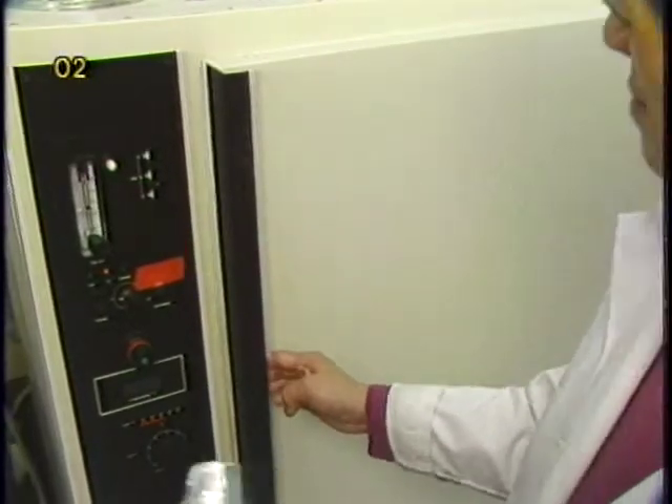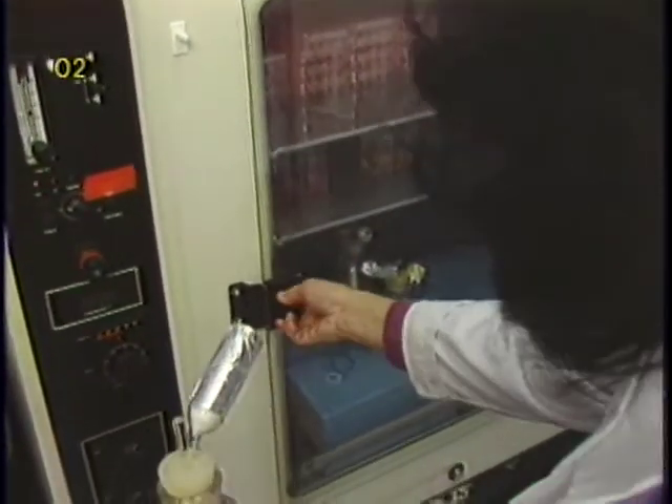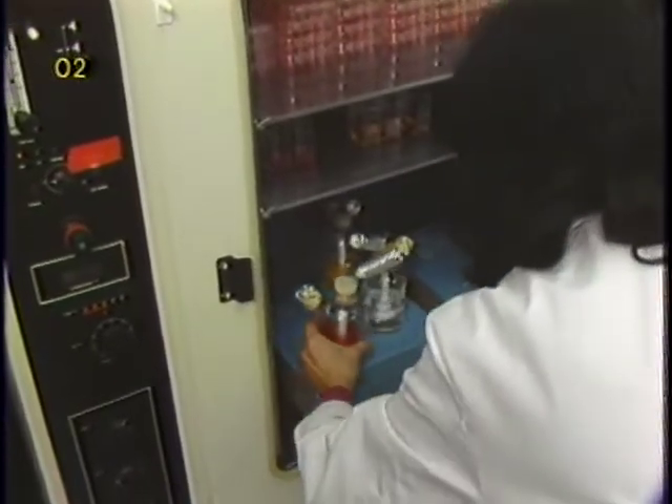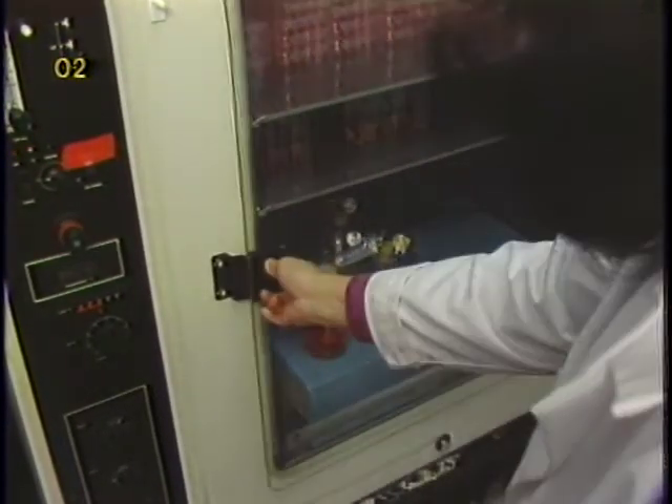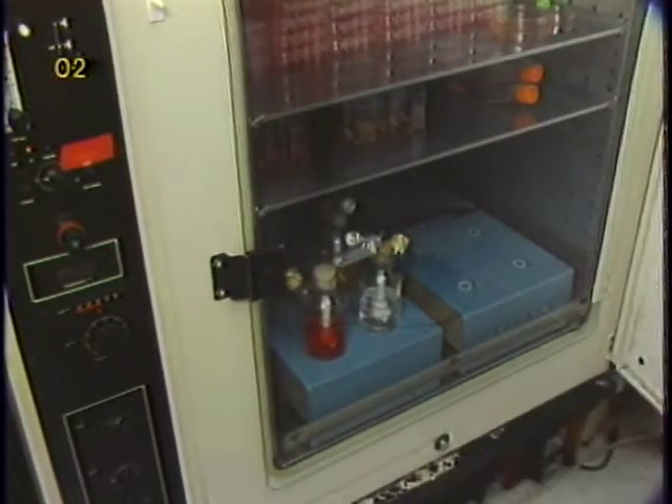The entire flask is then incubated at 37 degrees Celsius in an appropriate carbon dioxide environment. This step is important to allow the temperature and pH to equilibrate before the inoculation.